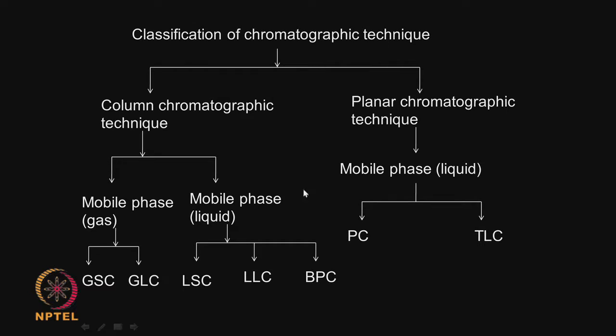Now, you must have heard about gas chromatograph. Gas chromatographs have been there for a very long time. If this mixture of solutes is vaporizable, then gas chromatography is also a very cheap and a very powerful technique.